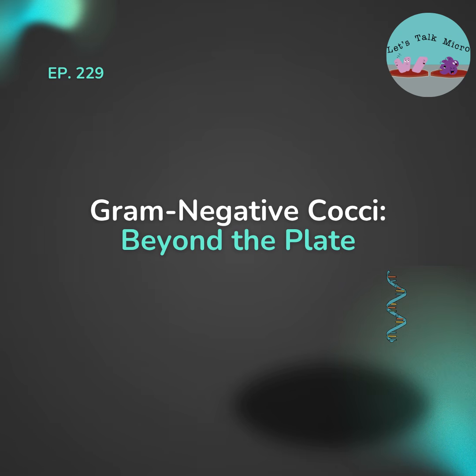And for the benefit of those that are tuning in for the first time, the first episode focused on the gram stain and the different genera and species. And I also went over some sites where you can expect to see gram-negative cocci. Of course, we have two major genera, which are Moraxella and Neisseria, and we know that there are some species within these genera that are gram-negative rods. But we are focusing on the gram-negative cocci ones.